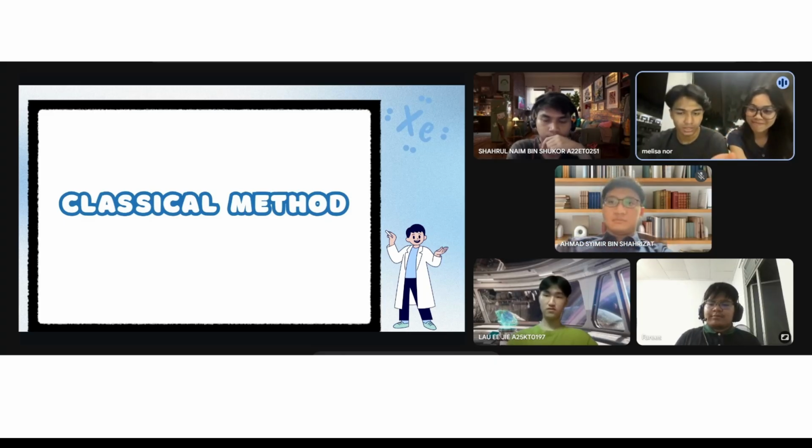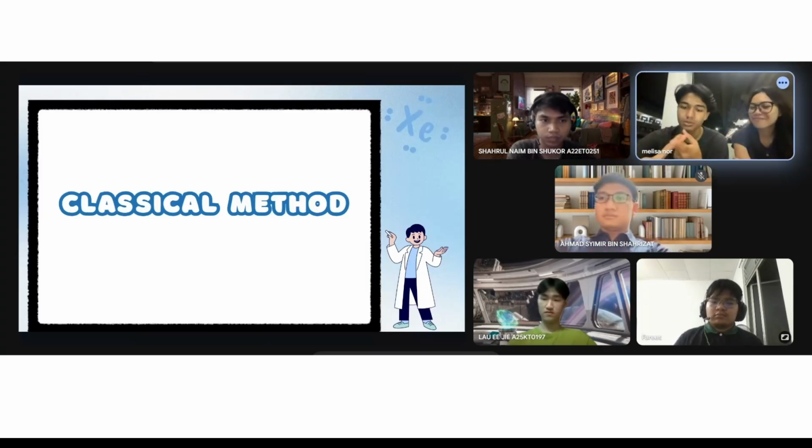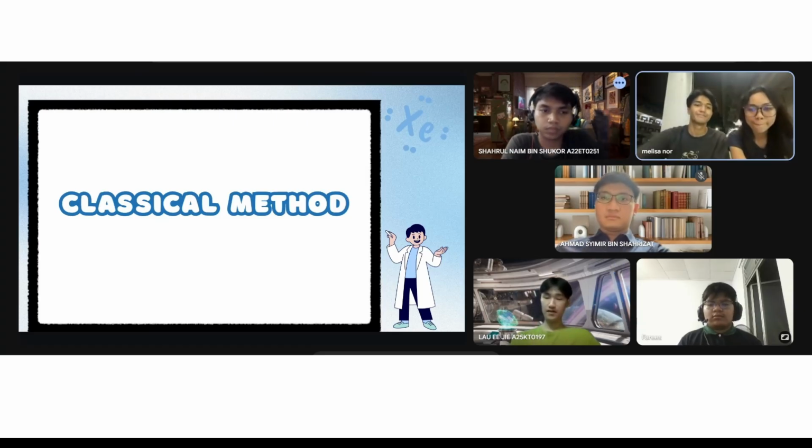When the mixture is heated up, reducing sugars such as glucose react with the blue copper(II) ions in it. Then the copper(II) ions are reduced to copper(I) oxide, so it will produce a color change. The color changes from blue to green, then yellow, orange, and lastly, it will end with a brick red color. So what does this mean? The more glucose present in the sample means the more intense the color change.